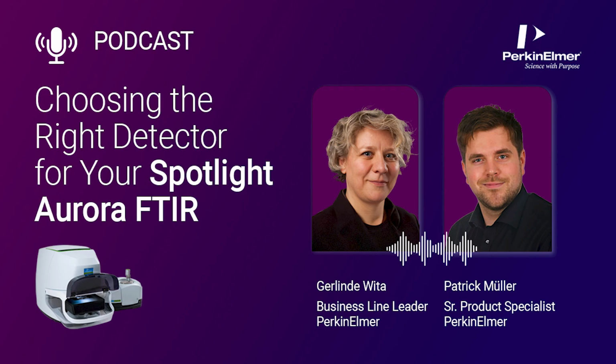then the more convenient and easier to use detectors are obviously the two detectors that are not cooled with liquid nitrogen. And there's something else regarding this. There are obviously specifications or performance metrics for all of these detectors, but these vary even within the same detector type. So let's say you choose a liquid nitrogen cooled MCT detector, then this might have a different performance for us than it has, for example, for some other MCT detector at another instrument. So this is another thing you have to keep in mind.